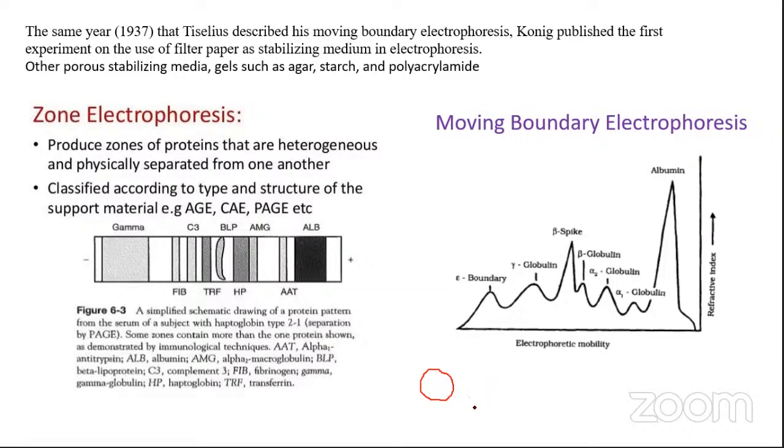So now, the concept is slightly different from the concept of gels that are used during chromatography. You cannot have the same gels that you use for chromatography used here, because in chromatography the gels that are used are in the form of gel beads.